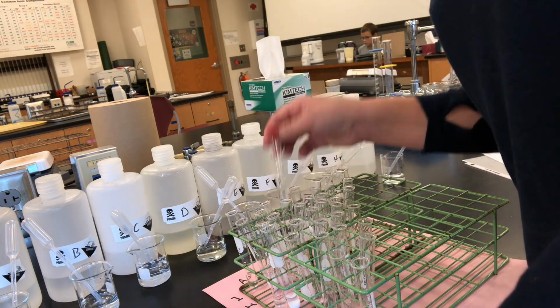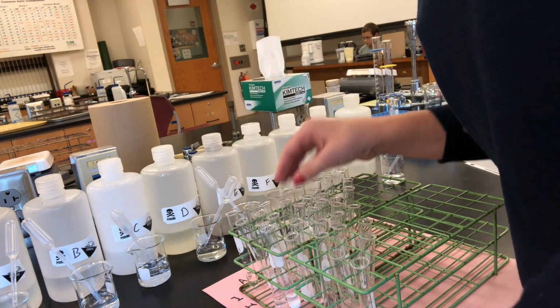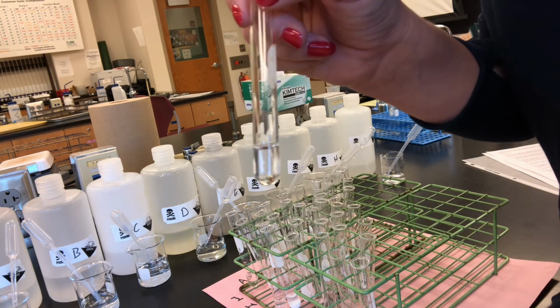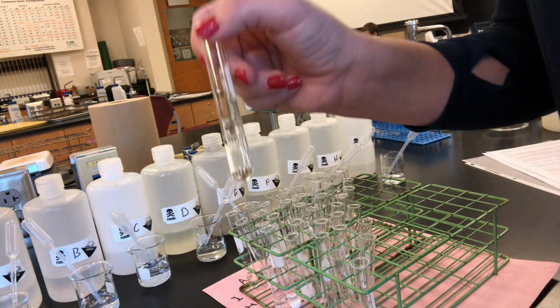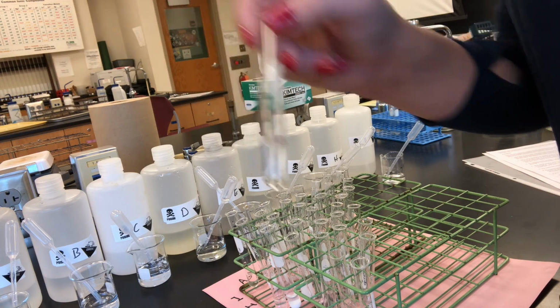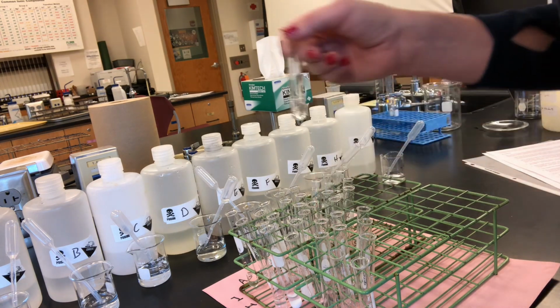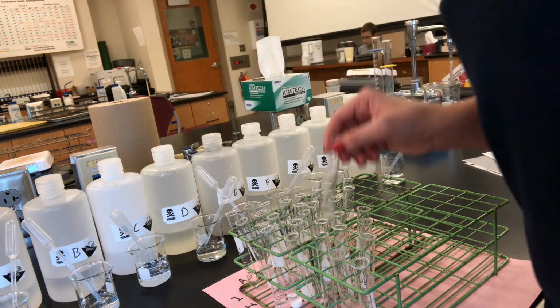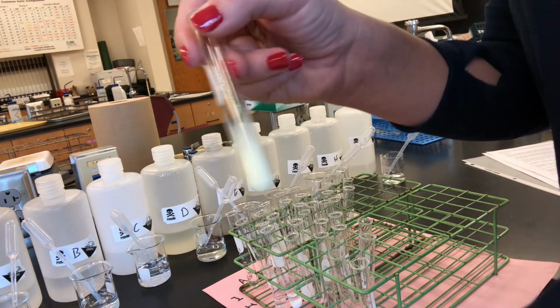All right, D and I, no change. D and H, no change. D and G, no change. D and F, no change. D and E, however, yellow.